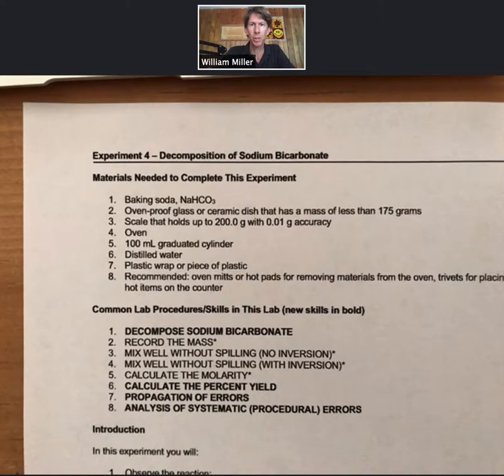This is experiment four: decomposition of sodium bicarbonate.